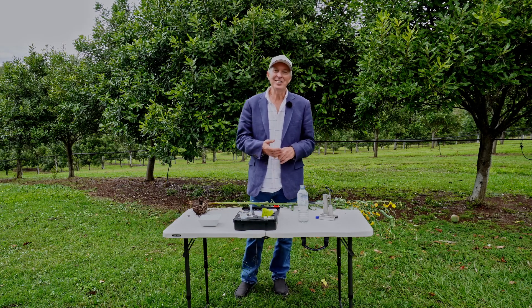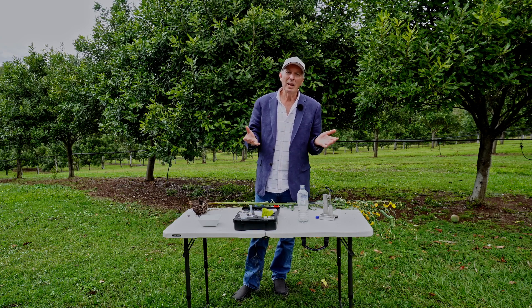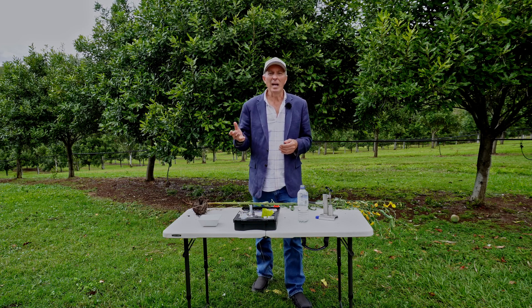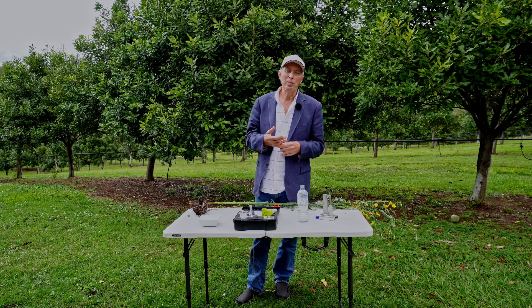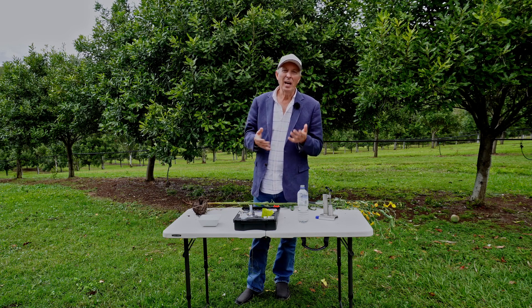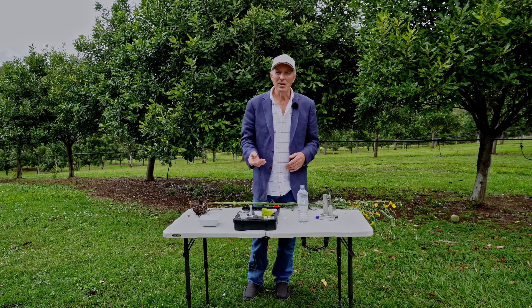Welcome back. We're here to talk about another very important little tool for this whole concept of nutrition farming. It came about with a woman who developed a couple of patents for specific blood tests, did quite well, retired, bought some land, and realised there's not a simple test to measure soil life — so she went about developing something to achieve that. Unfortunately she didn't get to see the expansion of this, because it's really become popular as it was just what was needed. The tool is called a microbiometer and I'm about to show you how you can utilise it.